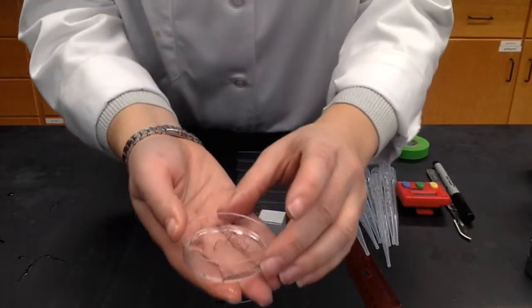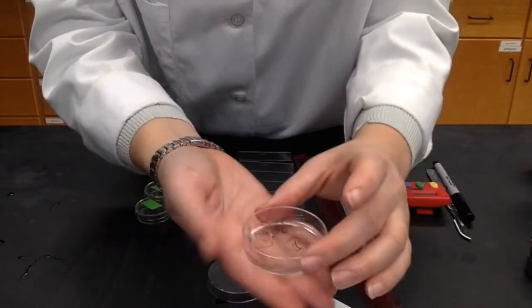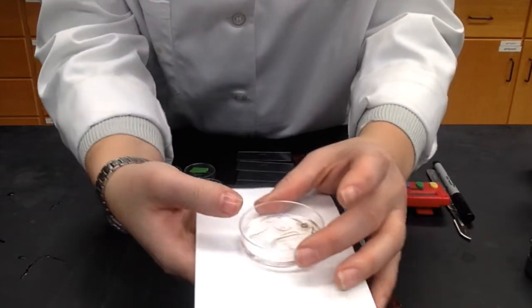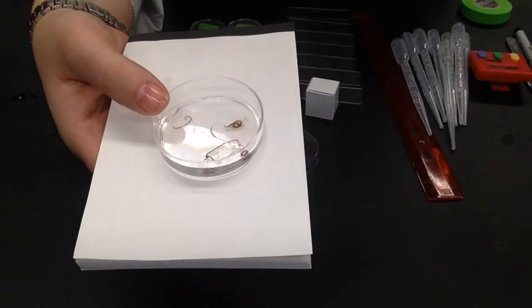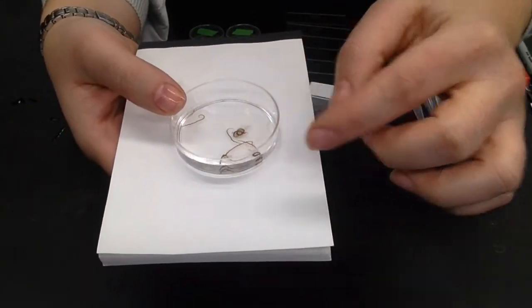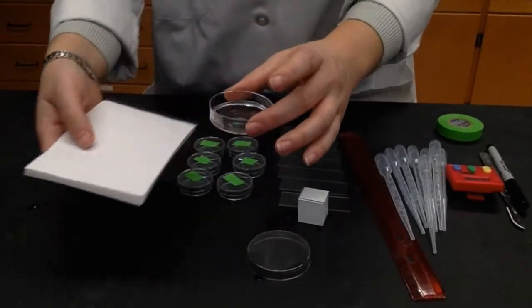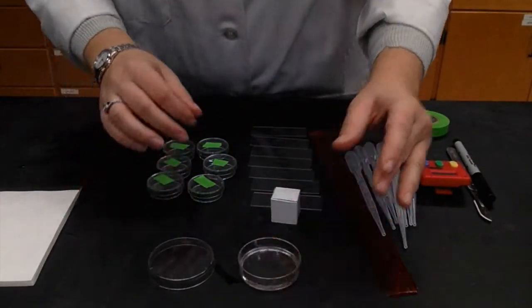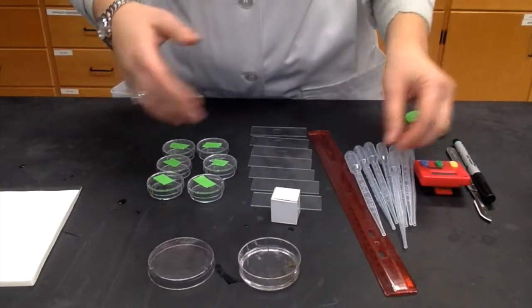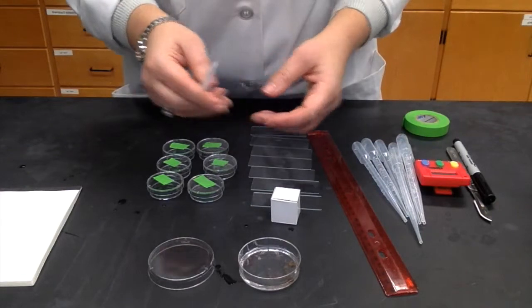The worms in here will be varying shades. Some of them are lighter and darker. The darker points on the worm represent the areas where the worms are more established, and the newer parts are where they've regenerated. So you're looking for worms that are roughly the same color and size when you cut them. We're cutting off the head and the tails of the worms, so that way we're only looking at a section that's autorhythmic of the worm.